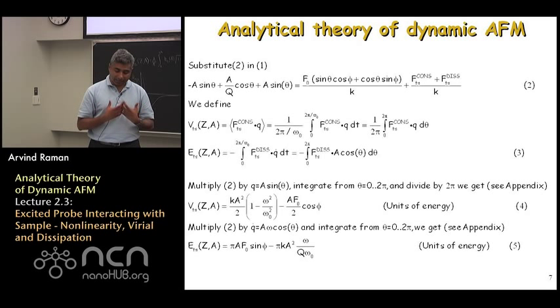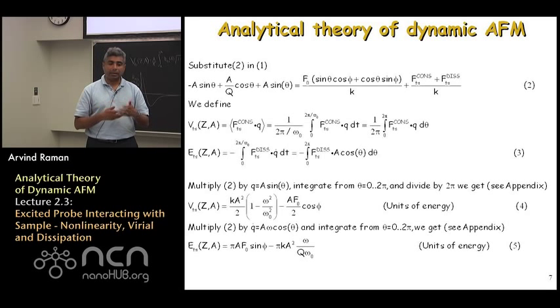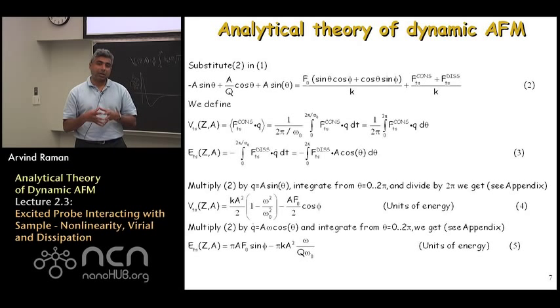So this literally is trying to measure the work done due to dissipative tip-sample interaction forces. Again, the physical significance will be dealt with later. The important thing is that this E sub ts quantity is not an average quantity, so it's not divided by the time period. It is the overall energy over the tip-sample cycle.